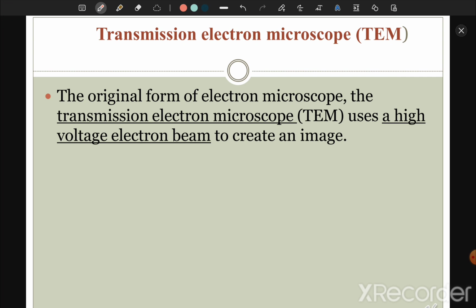Whatever metal material can be heated to produce an electron beam, it will emit this beam of electrons. And of course, because the electron beam runs in a vacuum, it will move with very high speed. This vacuum has different voltage.